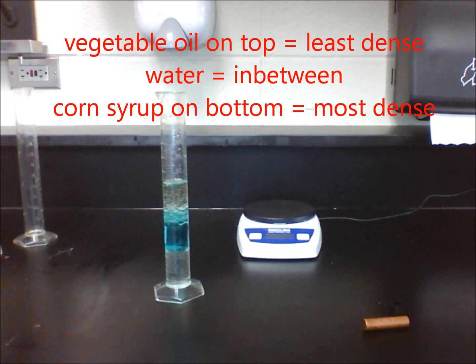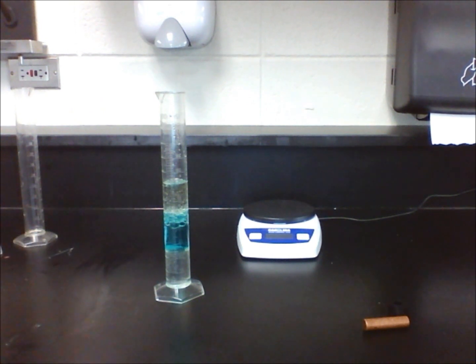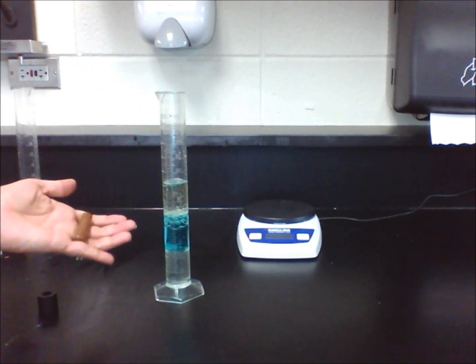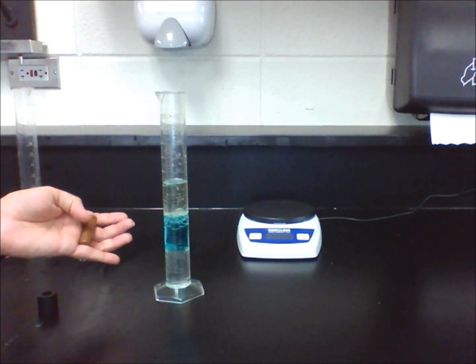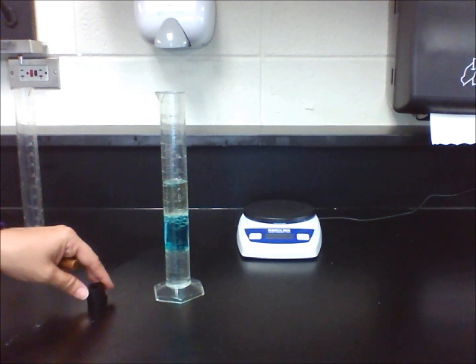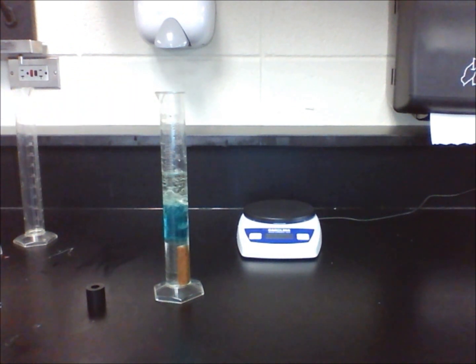Let's now see what happens when we drop solid objects into the density column. We know from lab 2 that the density of the copper cylinder is around 9.35 grams per cubic centimeters, and that the nylon spacer's density is around 1.3 grams per cubic centimeters. This explains why the copper cylinder sinks to the bottom of the graduated cylinder, and why the nylon spacer floats right on top of the corn syrup.